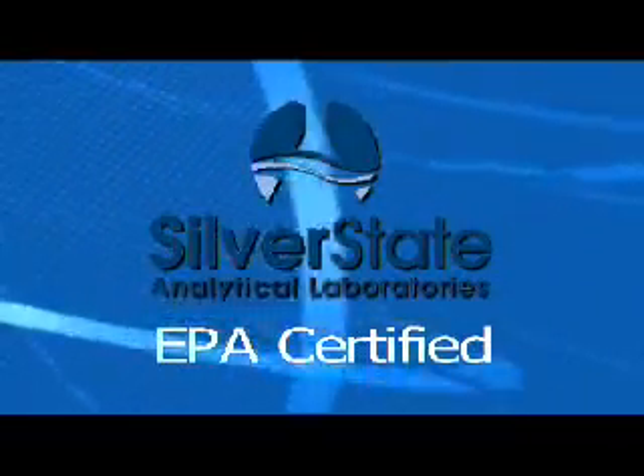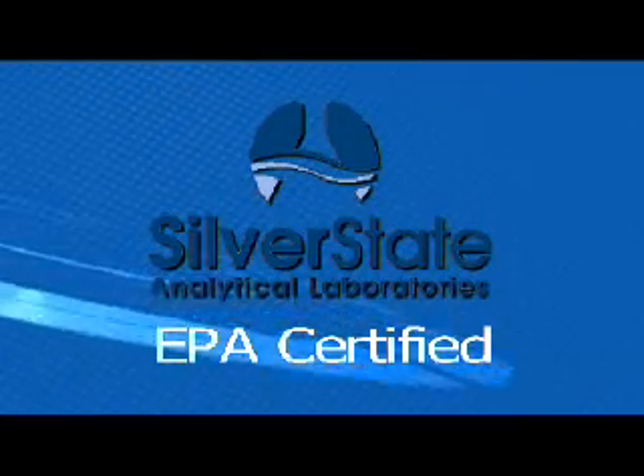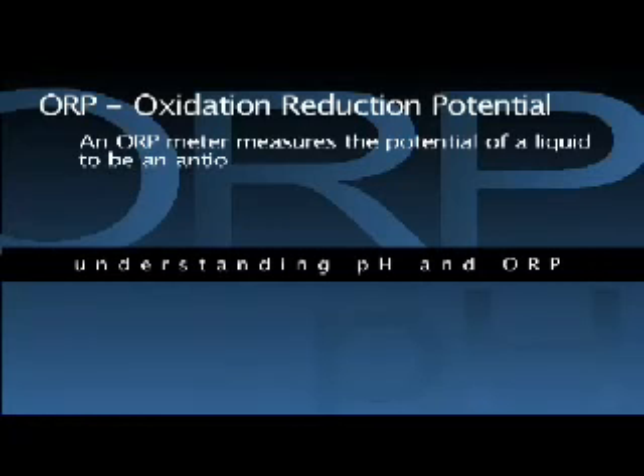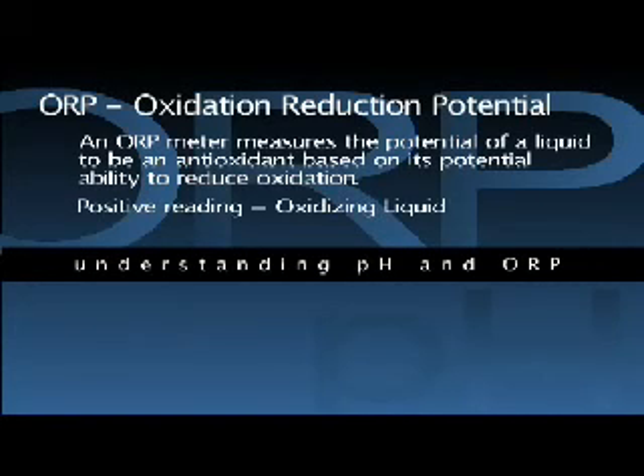The tests you are about to see were performed in a highly controlled, licensed and certified laboratory environment using a highly sensitive lab grade pH meter accurate to within 0.01 pH. An oxidation reduction potential meter, also known as an ORP meter, measures the potential of a liquid to be an antioxidant based on its potential ability to reduce oxidation. A liquid with a positive reading from an ORP meter is an oxidizing liquid, and the higher the positive number, the stronger the oxidizing potential of the liquid.